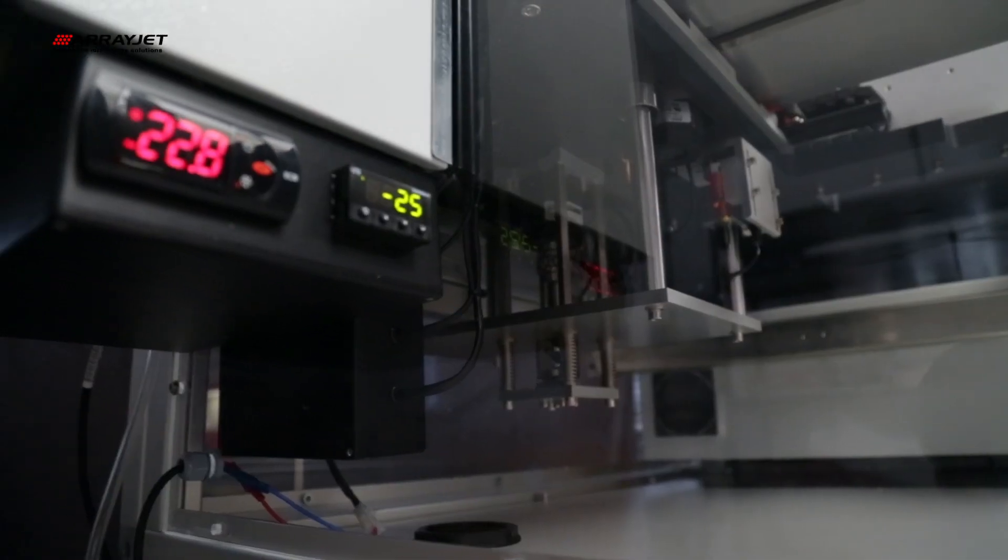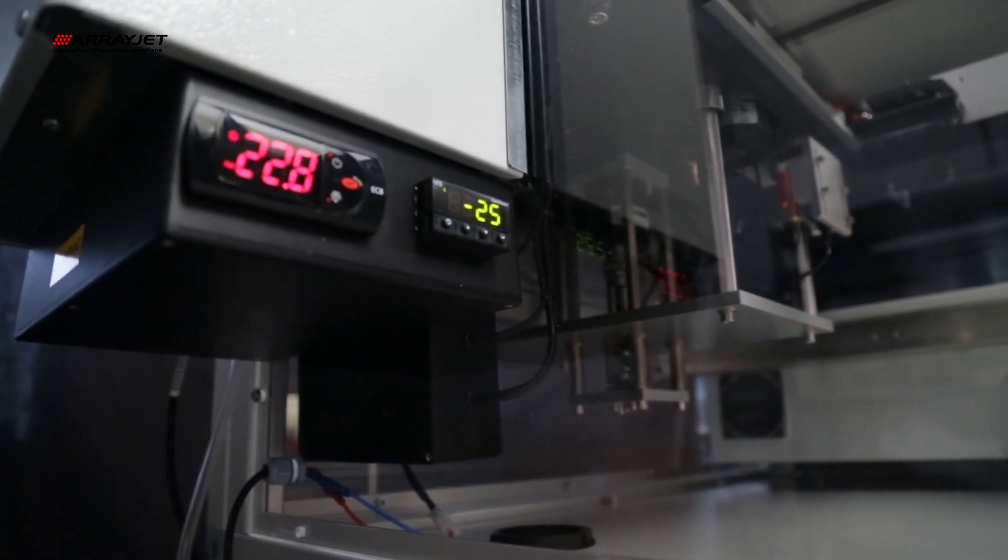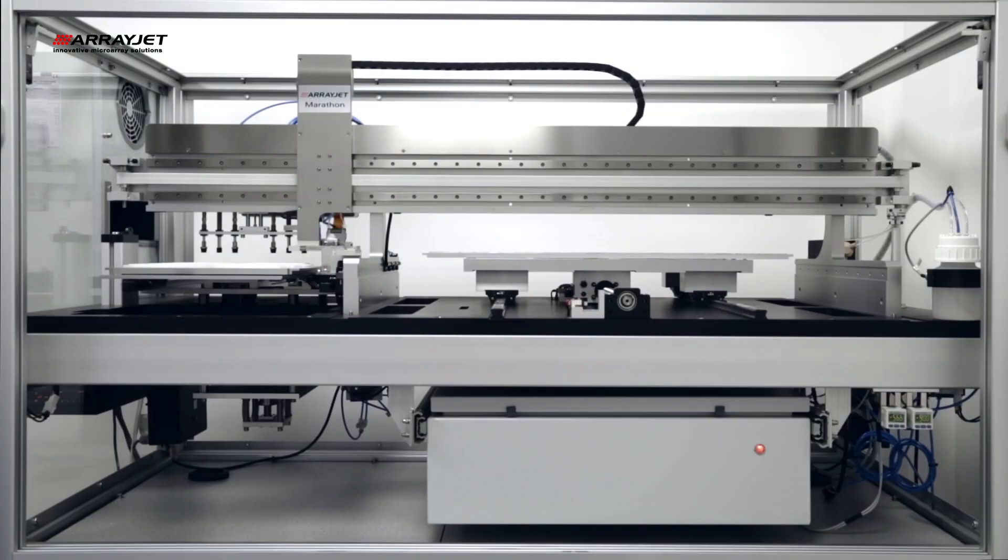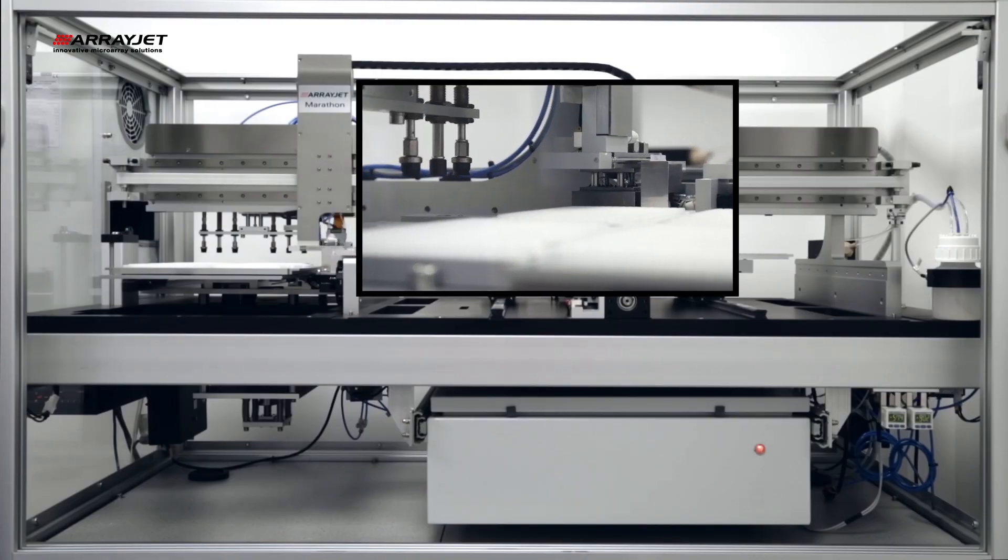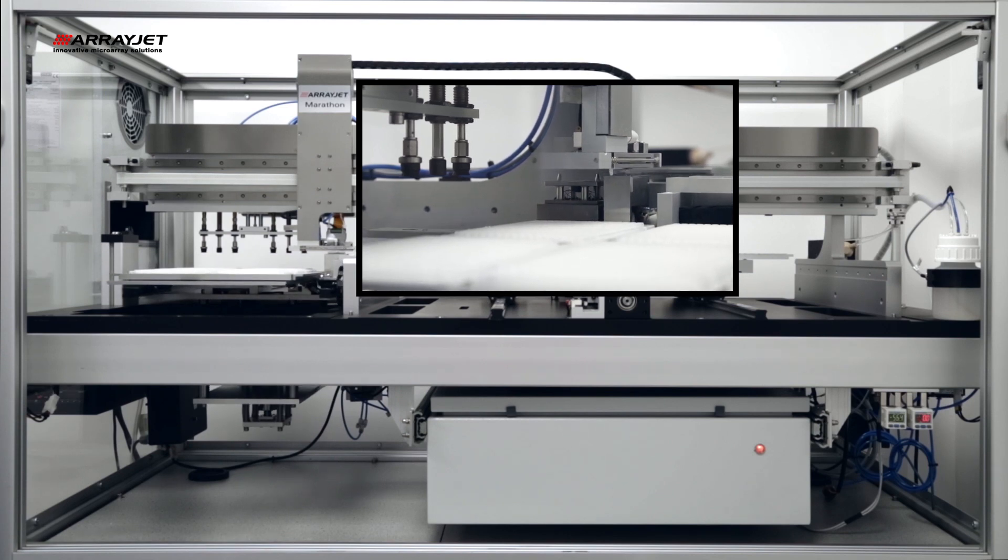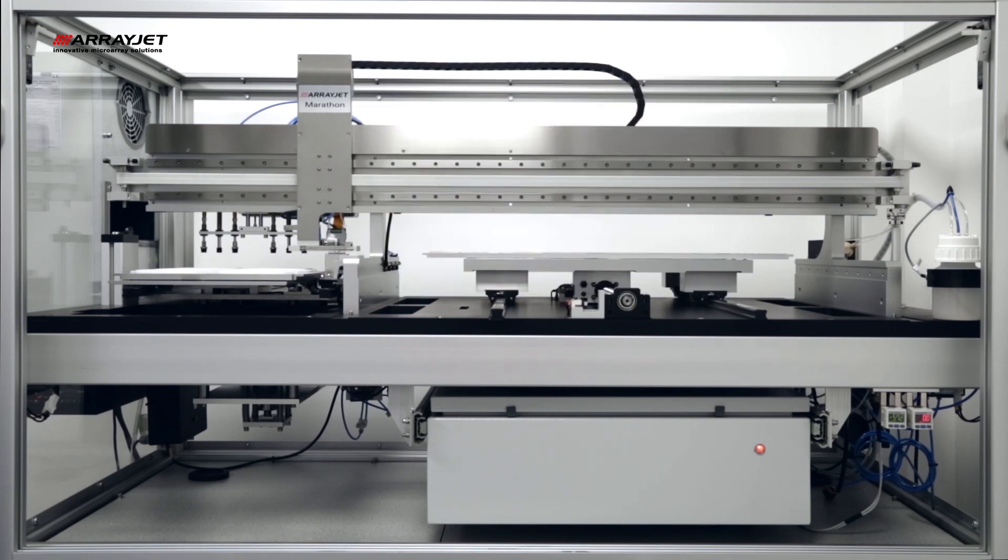ArrayJet's jetmosphere ensures complete temperature and humidity control throughout the printing process. After printing each set of probes, the printhead and jet spider undergo comprehensive and validated wash processes to eliminate cross-contamination.